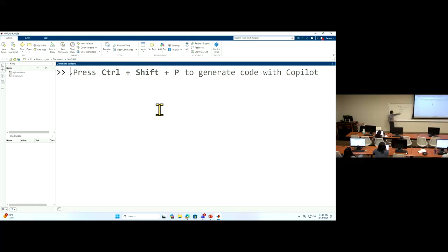So if you give this directly to the PCA function, you will mess up the variables and the samples. So we need to transpose this to be cell by gene in order to put into here, okay? Just make sure you understand which is the sample, which is the variables describing each sample's property.